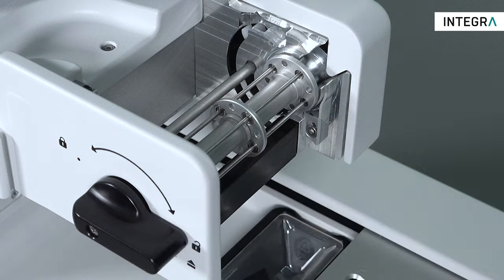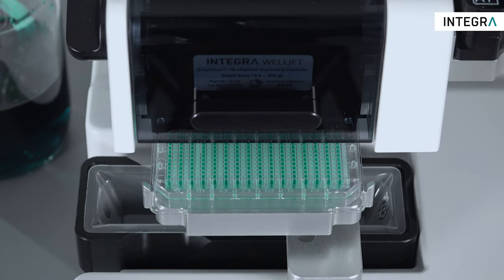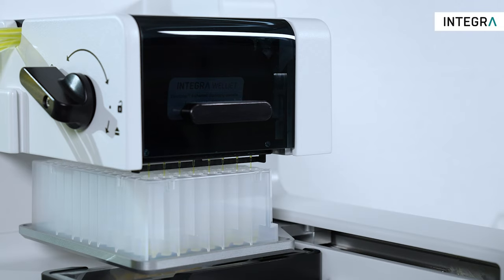The gentle peristaltic pump-based technology allows non-contact dispensing of liquids ranging from 0.5 microliters up to 10 milliliters.